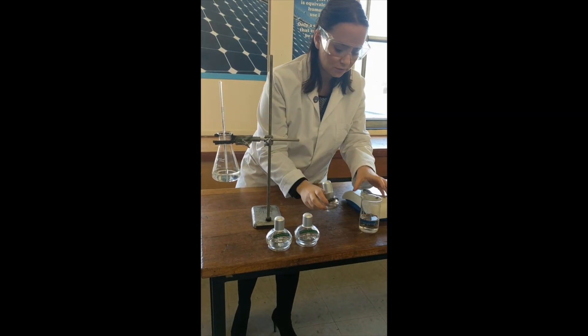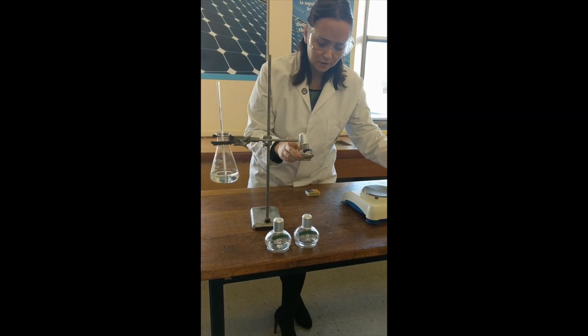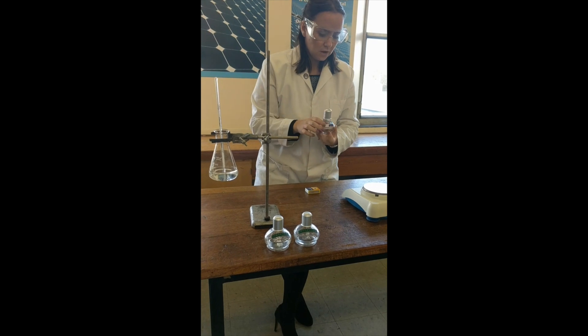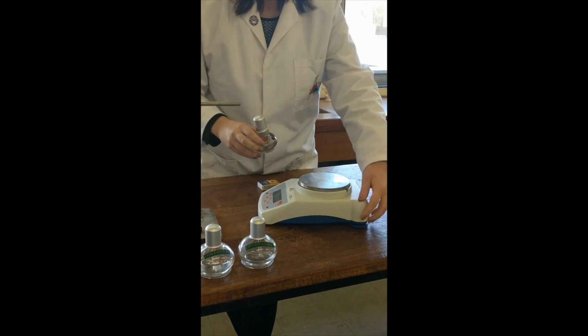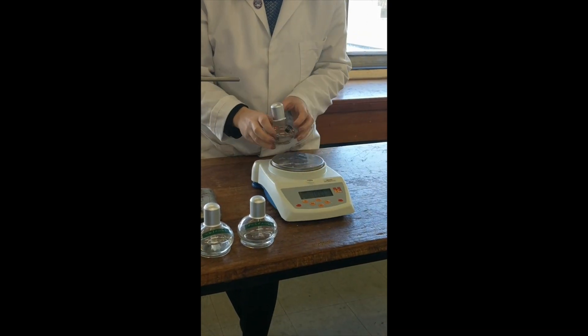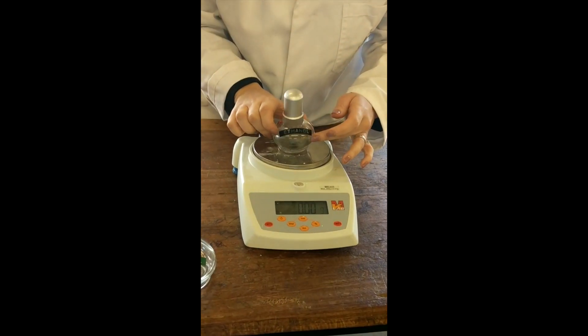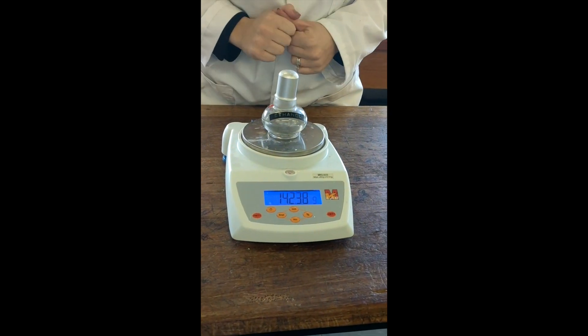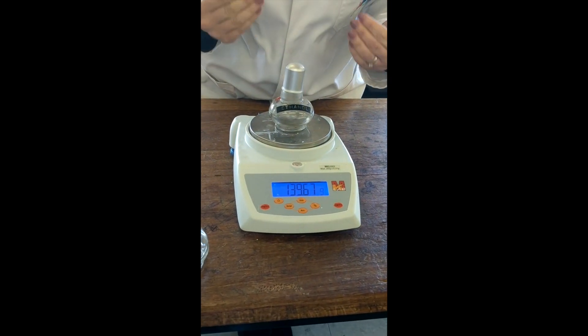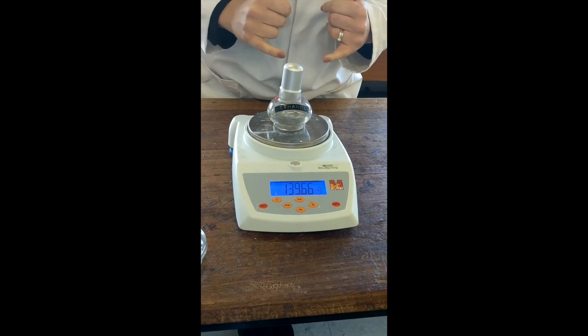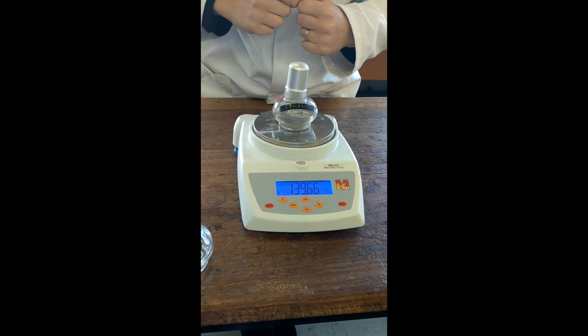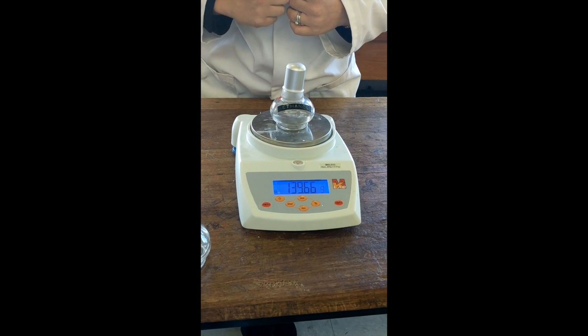So if we use our first fuel now, which is ethanol, you're going to need to weigh it on a balance with the cap on it. And you will record what the mass of the spirit burner and the cap is together before the practical.